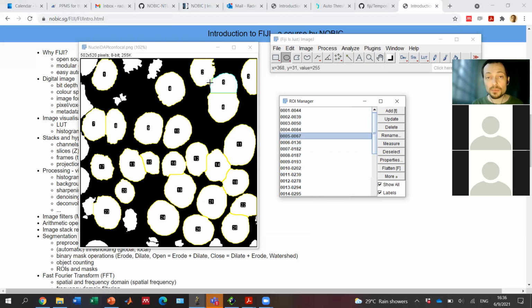You see that I'm highlighting the different regions. It can also be useful, for example, if you have a multi-channel image, because these regions of interest will then propagate to all channels. So if I use one channel to segment these objects, then I can look at the regions of interest in another channel, for example.